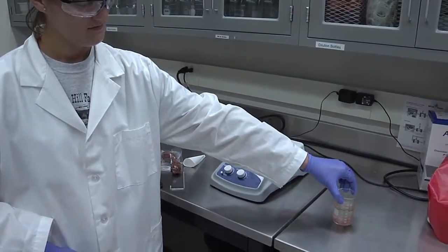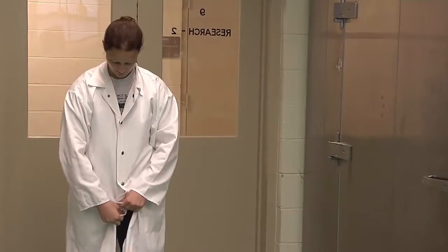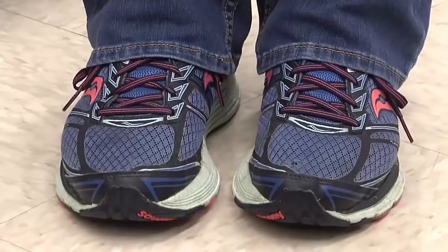At minimum, the employee performing the titration assay should always wear eye protection, a lab coat or apron, as well as non-latex gloves and closed-toed shoes.